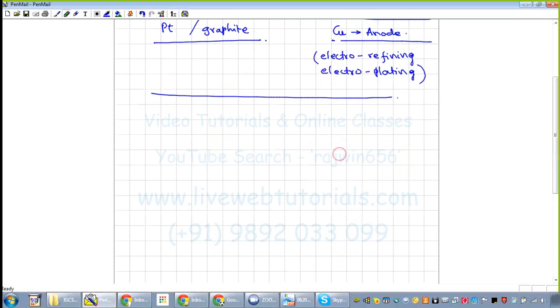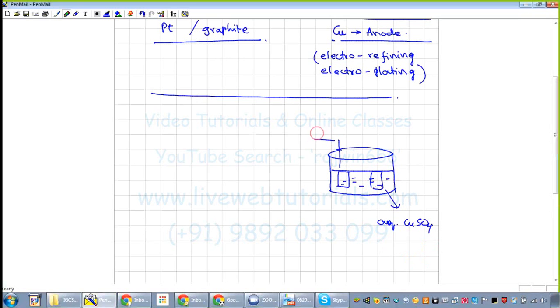The electrolytic vessel contains the electrolyte, aqueous copper sulfate. The two electrodes: the positive electrode is the anode, and the negative electrode is the cathode. The bulb and other components are there; switch it on. First we are going to write down the dissociation reaction.